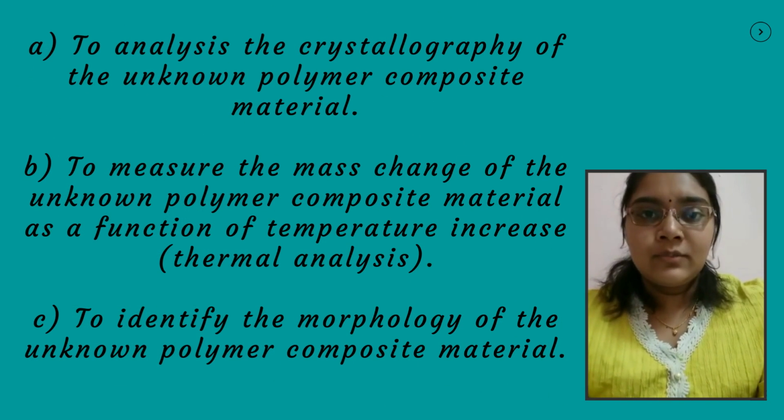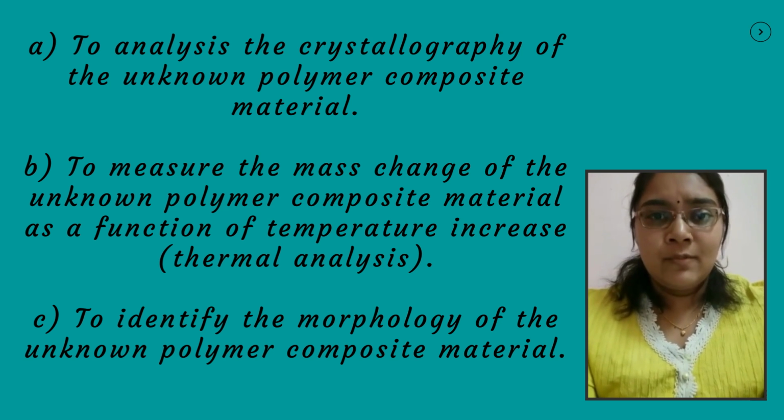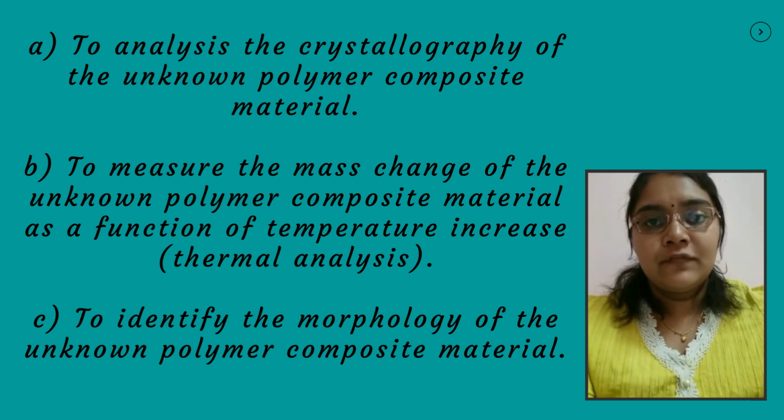There are three main objectives for our study. First, to analyze the crystallography of the unknown polymer composite material. Second, to measure the mass change of the unknown polymer composite material, especially for thermal analysis. And the last one is to identify the morphology of the unknown polymer composite material.